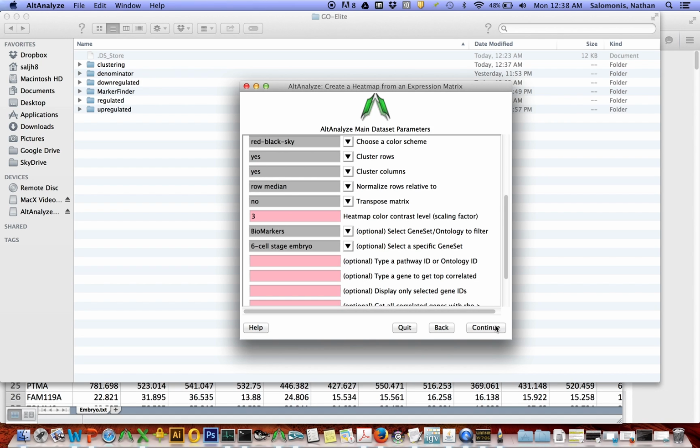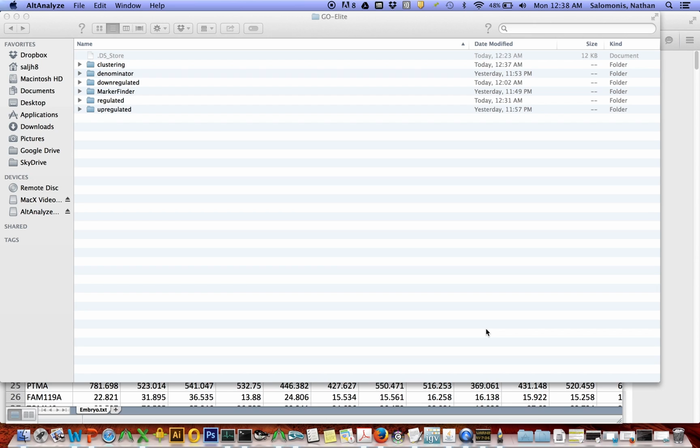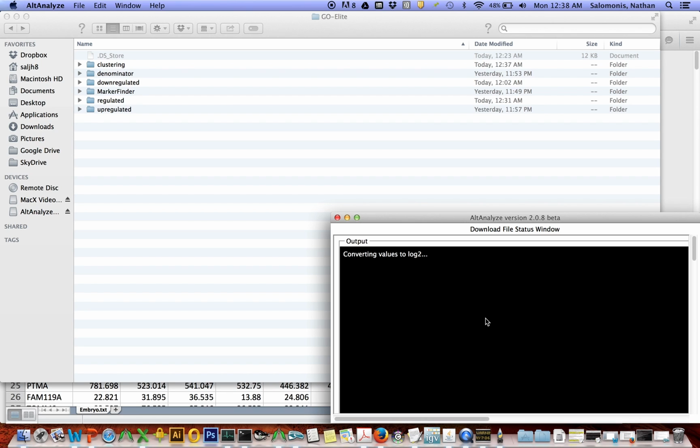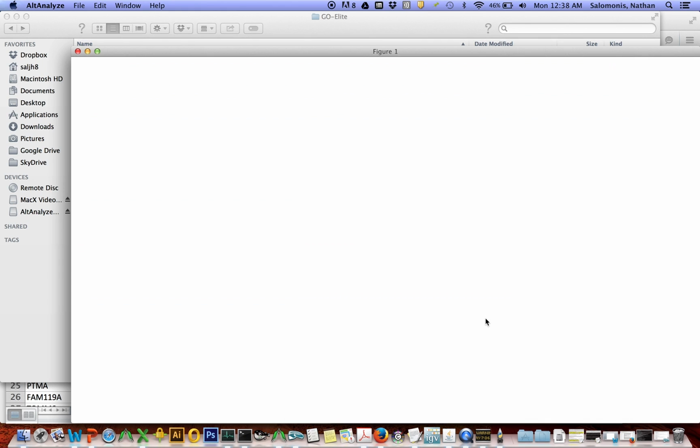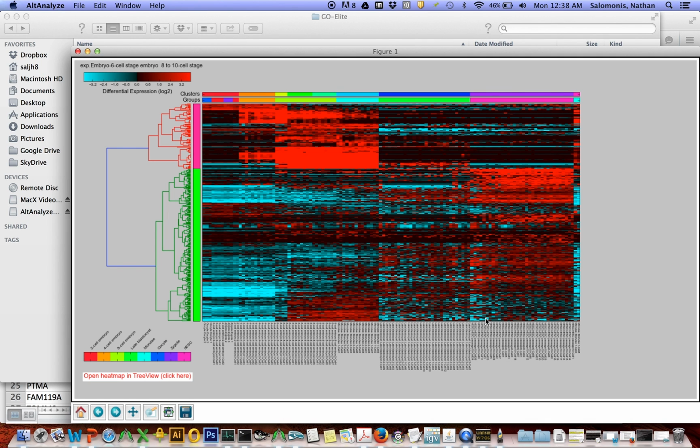So now it's going to select a large variety of genes, and we can visualize those too, again, relatively quickly. There are a large number of options within this heat map viewer. We're only scratching the surface, and in fact, the second set of our tutorials are going to focus just on the heat map viewer, since there are a lot of advanced features that really give you some creative ways to look into your data. So we'll just wait here a moment for this analysis to complete, and there we go.